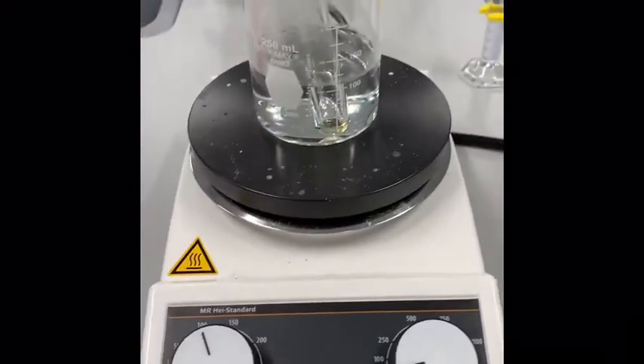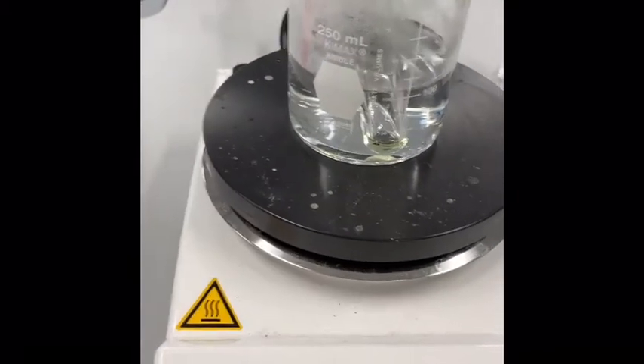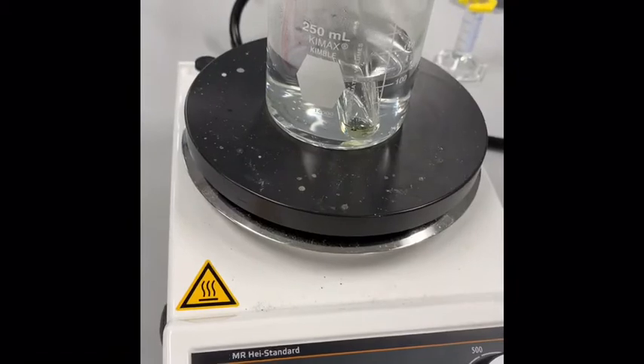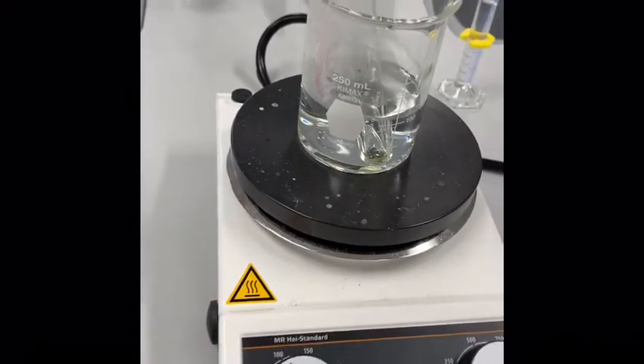We've got our oxime and sulfuric acid mixture reacting in our hot water bath. It should be around 80 degrees — we've turned it up just a little bit. We're going to do a small workup to check where the reaction is by TLC.